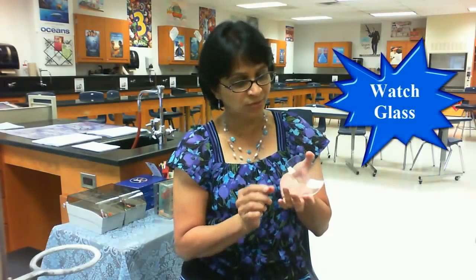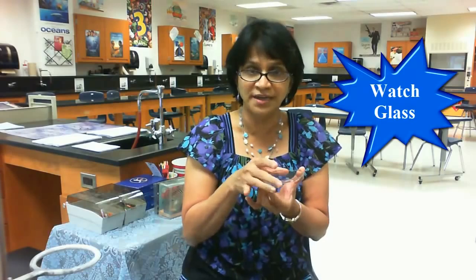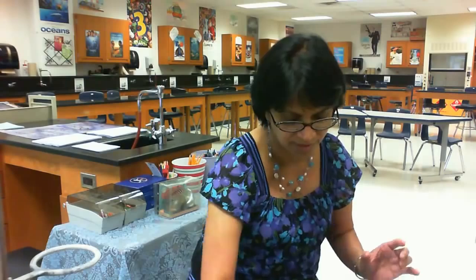Coming to a watch glass, which looks like a glass plate. It's a shallow, concave plate, and it can be used for keeping or measuring some stuff. We can also use this as a lid over a beaker to protect the liquids for a short time.